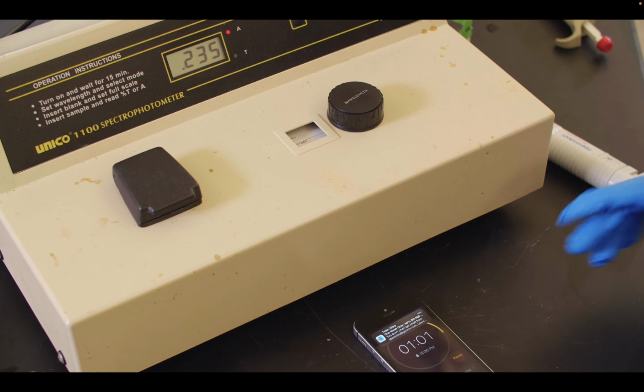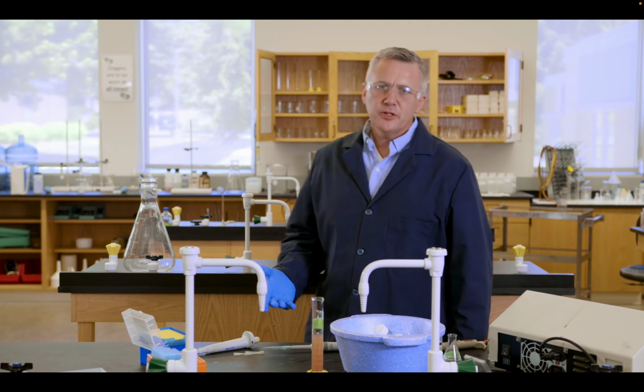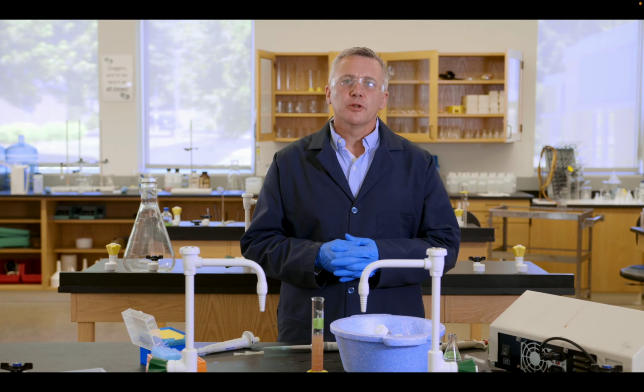At 3 minutes, it's looking good, we have 0.235. 3.5 minutes is also 0.235. So as we wrap up our 4-minute assay, it looks like the final value is going to be 0.234. As we've seen, for the GDH there's a very small change, a very small delta. And so this effectively means there is not much, if any, GDH at all.